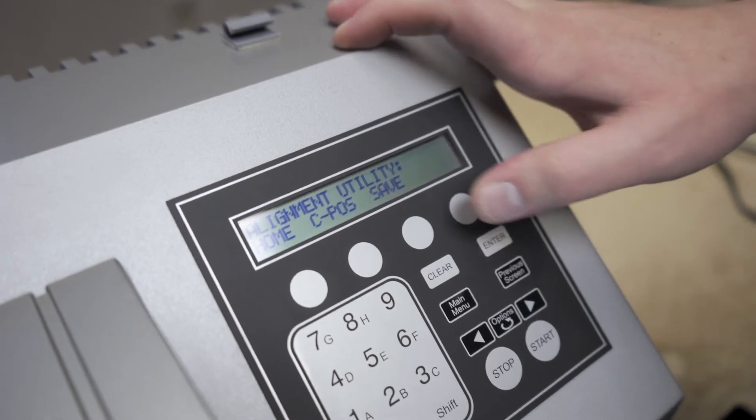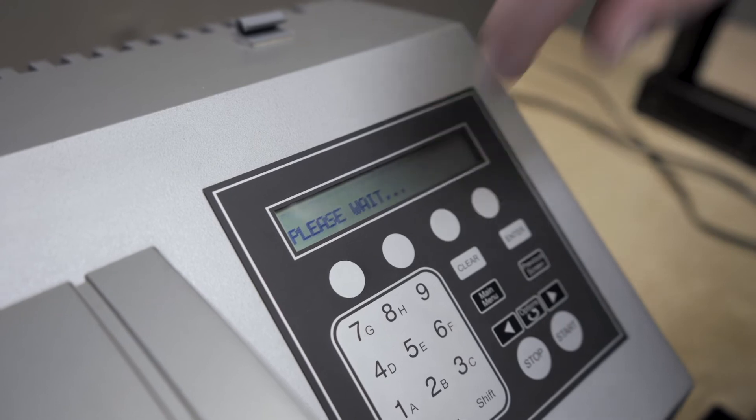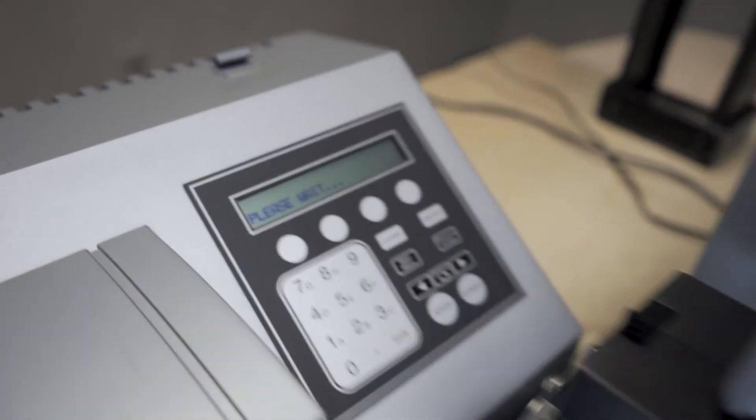When you're confident in your position, hit the previous screen button and save the C position. It'll ask you to confirm it — press yes. The stacker will home and you'll be ready to verify that position.